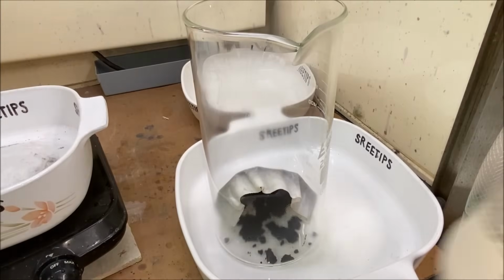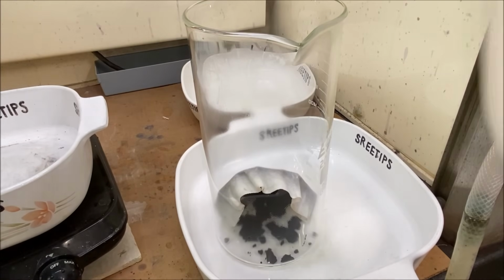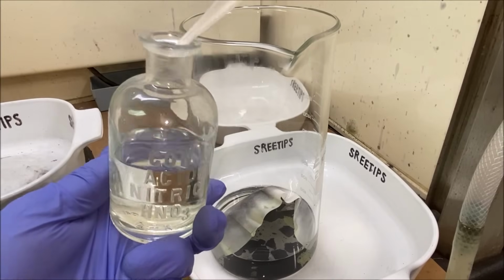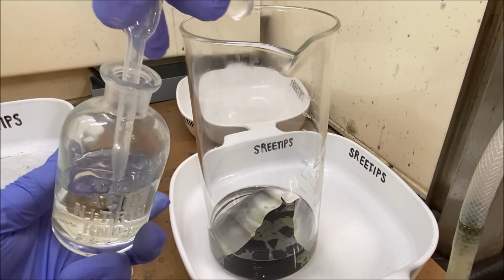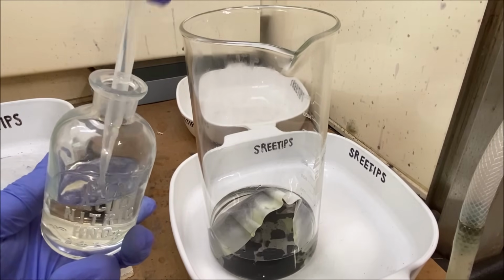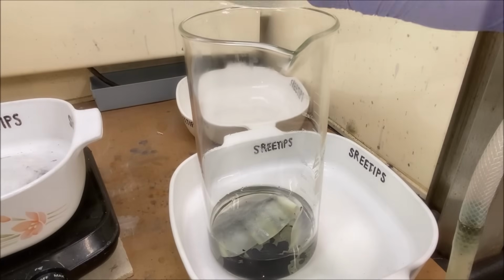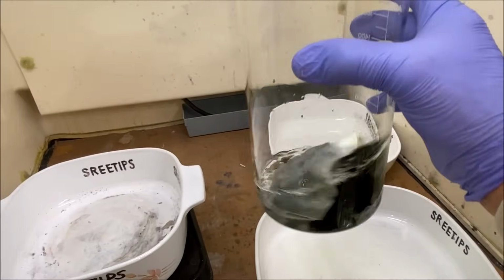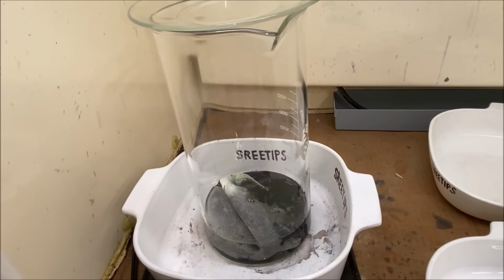What we're going to do, add some hydrochloric acid. I'll add a couple shots of nitric acid, form aqua regia, and we'll see if we can get this stuff to dissolve. Put a lid on this, and we're going to stick it up here on the heat. Add a little heat.